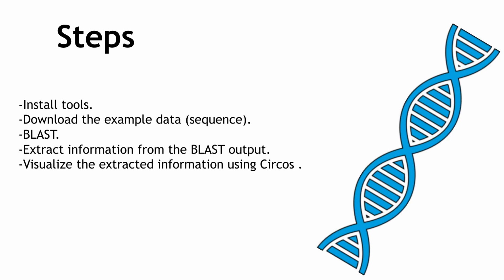So this is what we'll do. We are first going to install the tools we will use. We are going to use BLAST and then Circos. So BLAST will be used to identify the repeats, and then we'll use Circos to visualize the outputs.